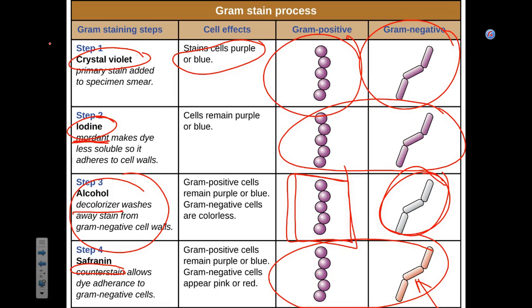In real life, for instance, for gram positives, it's a little bit tricky. You're always going to remove some crystal violet from them. So it's going to be a bit of a spectrum of blue, purple, really dark purple, violet. I don't know, all the spectra from dark purple to bright violet. With gram negatives, it's easy. Always pink.